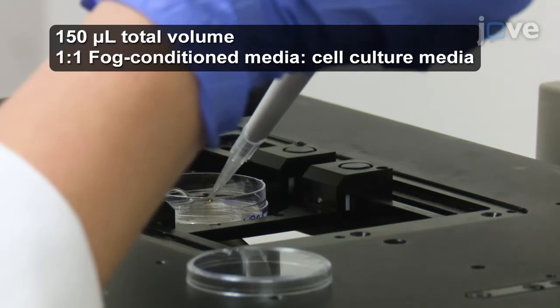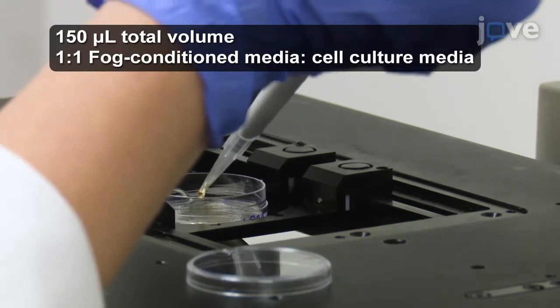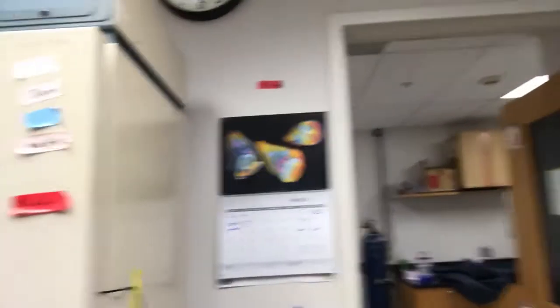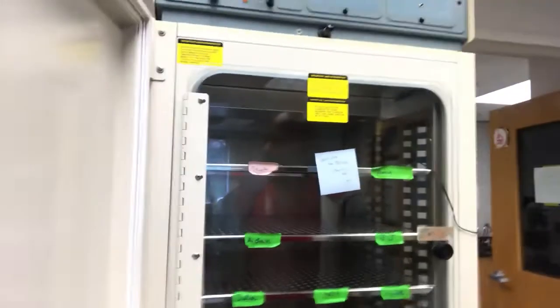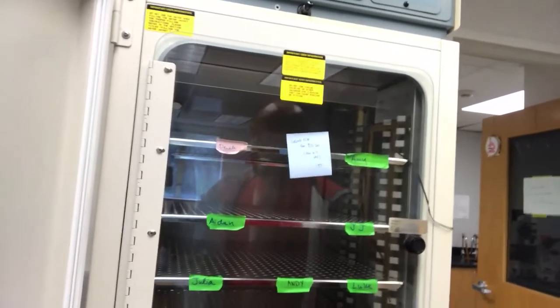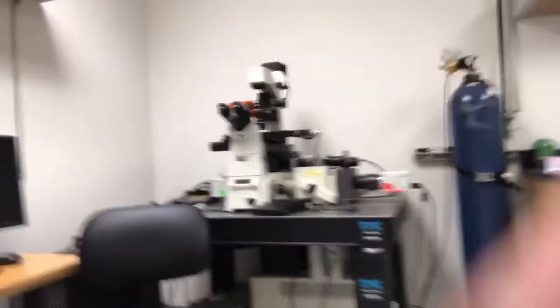It's a semi-sterile environment so that the cells don't get contaminated by bacteria. Here's the incubator — a standard incubator, a little bit old but it does the job — and you can see it is empty, and that's sadly because everyone had to shut the research down so that we can all be safe. This is my microscope room.